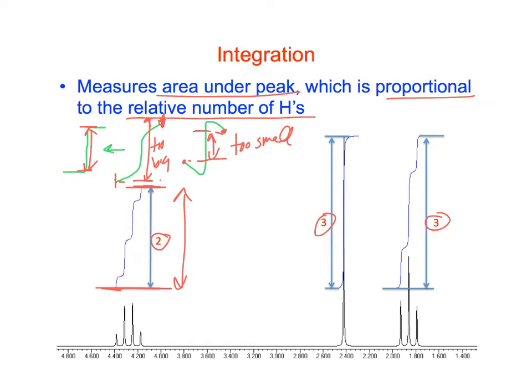Would running more scans help? Not well, because you clean up the baseline by removing some of the noise by increasing... Right, the noise itself, though, should cancel out, even in 16 scans. Yeah, usually it should.